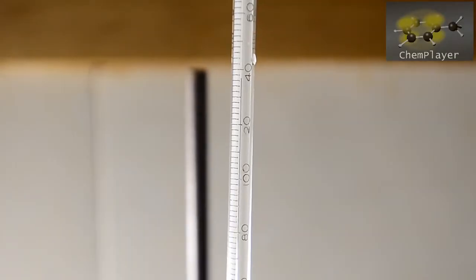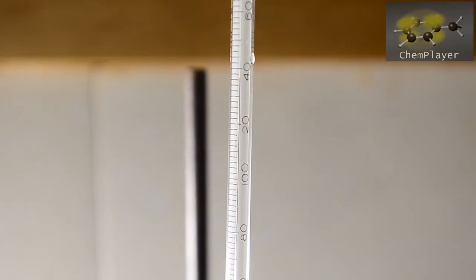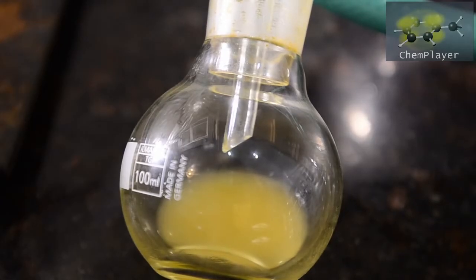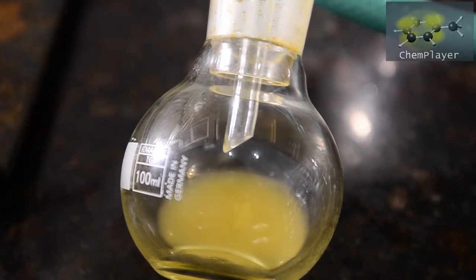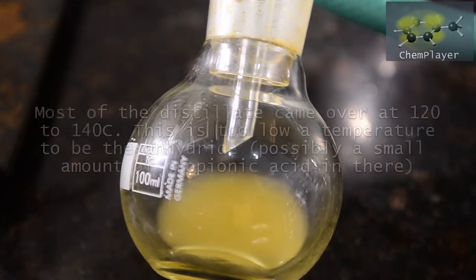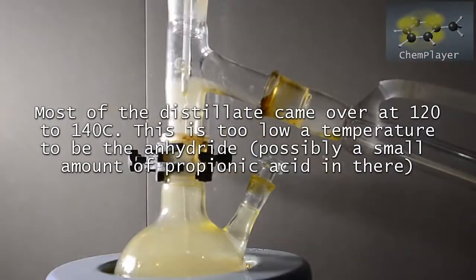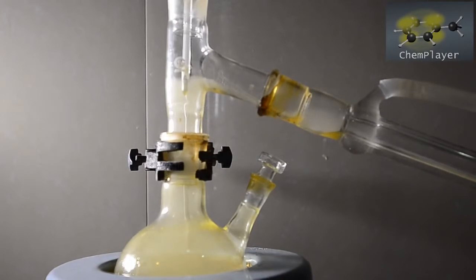But the maximum temperature that the distillate vapors reach is 140 degrees C, just for a short period. We keep collecting the distillate, which is coming off at 120 to 140 degrees C, until nothing more comes over. At this point the contents of the boiling flask appear black and quite charred.